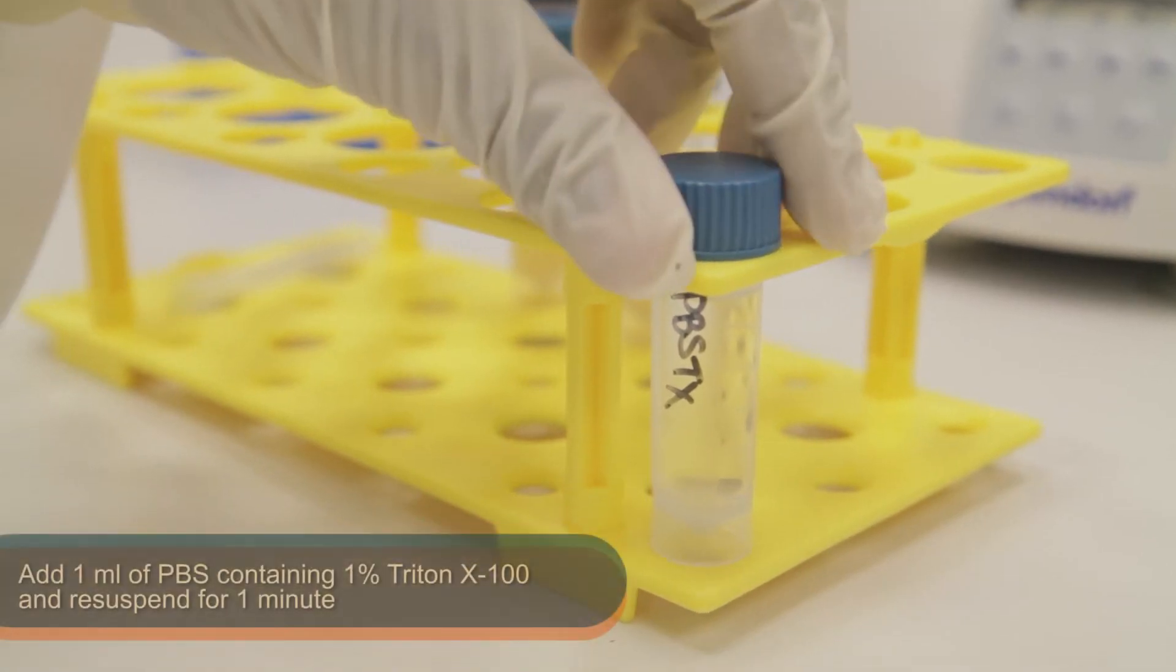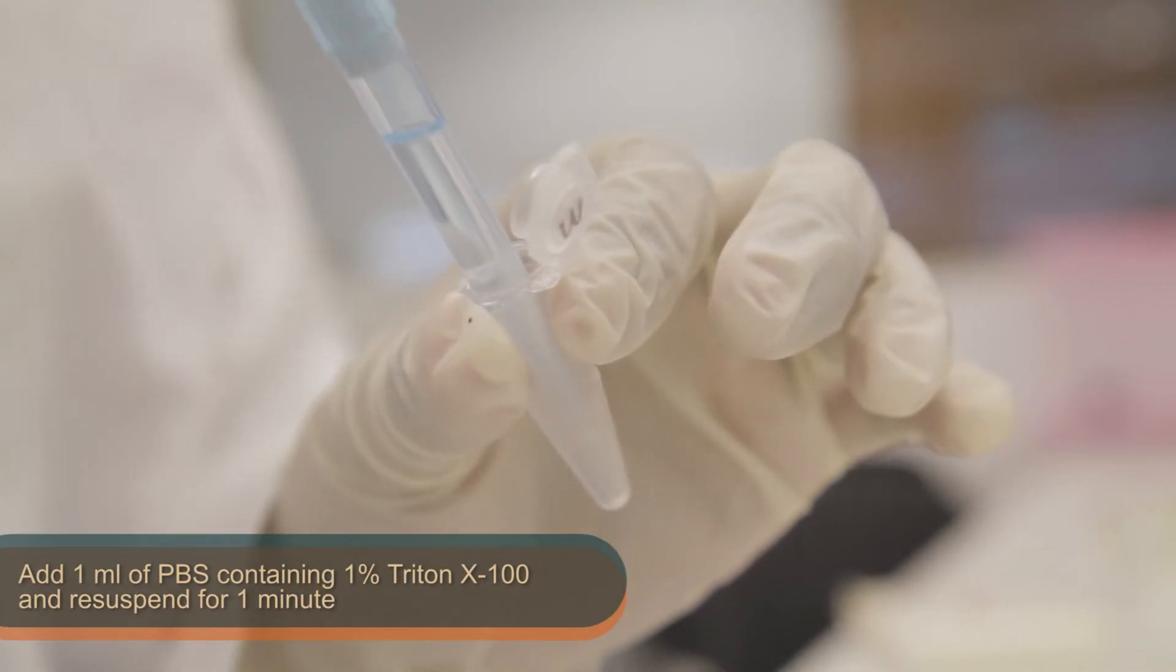Following this, add 1 ml of PBS containing 1% Triton X and re-suspend the cell pellet for 1 minute.